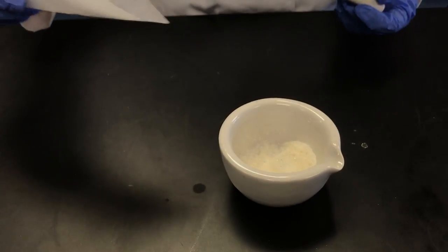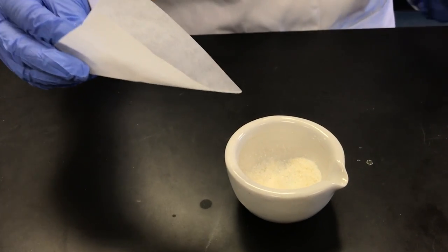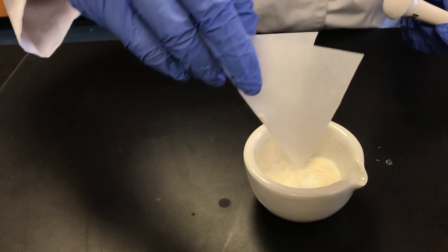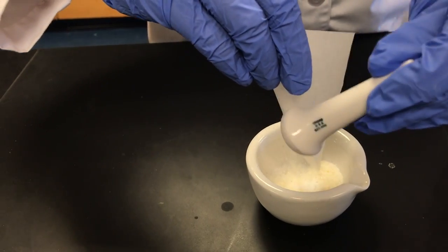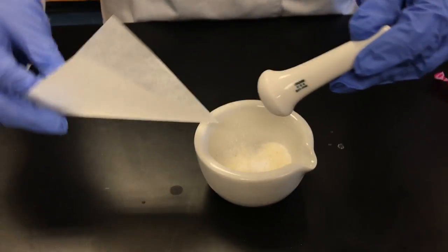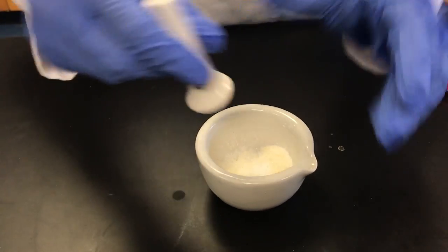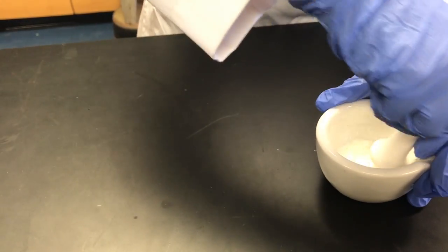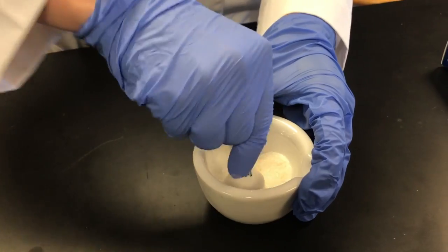To prepare sample number two, we're going to add the 0.1 grams of zinc gluconate into our fine powder that we crushed up from the lozenge. Make sure that you toss it about, and then you're going to do this for about two minutes. You're going to grind it together so that it's really evenly mixed. That's how you'll get a good reading on the XRF.